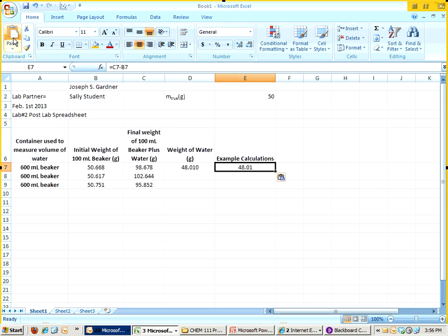Now right now we're merely performing the same calculation, and I actually would like to display the equation that I'm performing. So if I go up to the formula bar again, I can put an apostrophe in before the example cell calculation, and now that apostrophe says please print this in the cell as text rather than as a calculation. So I can see the text that I was using here. And if I wanted to align that to the left, I can go up to the alignment section under the home tab and hit align to the left.